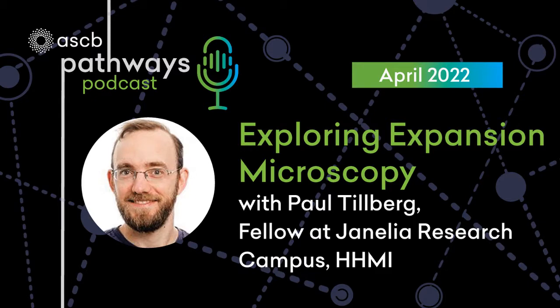infected with COVID. And as you say, they show really incredible remodeling of the cilia on the surface of the cell. And then they also have what to me is a really iconic image in that paper, where they label the membranes of the cells, and you can see that the virus is packed into multivesicular bodies, which are larger than normal. And then they caught one of those multivesicular bodies in the act of fusing with the plasma membrane. And you can see a little hole where there's a continuous space between the extracellular side and the lumen of that multivesicular body. So, I mean, it's just a stunning image.